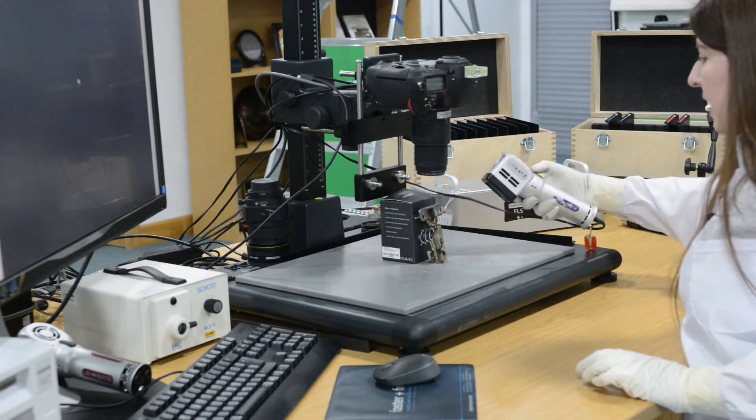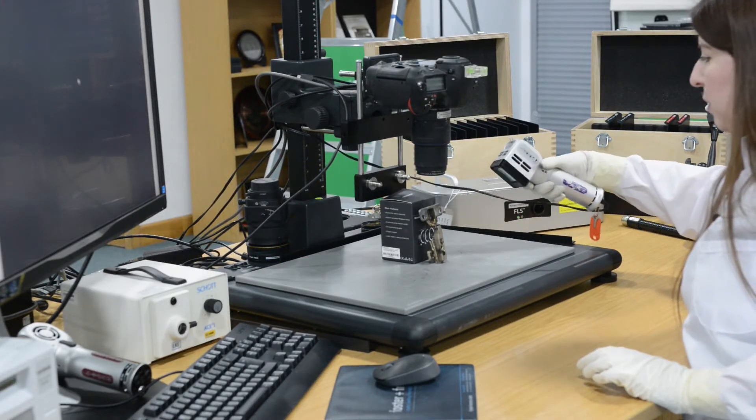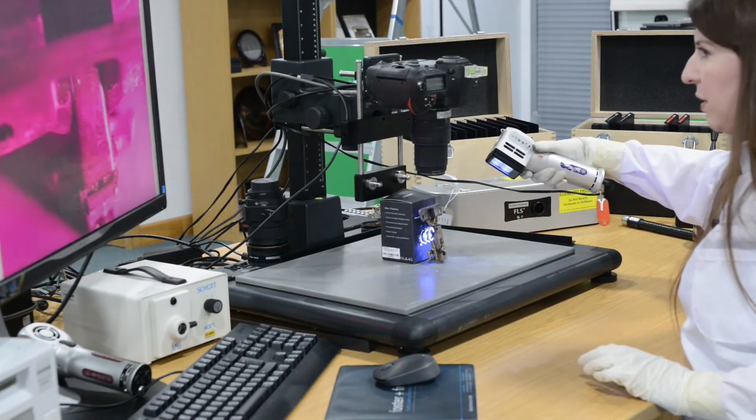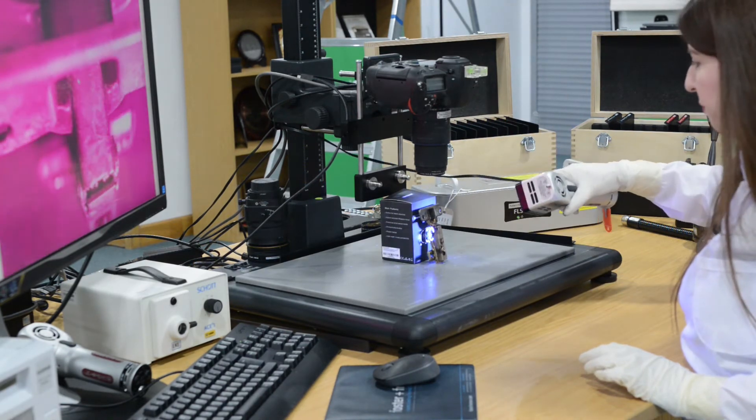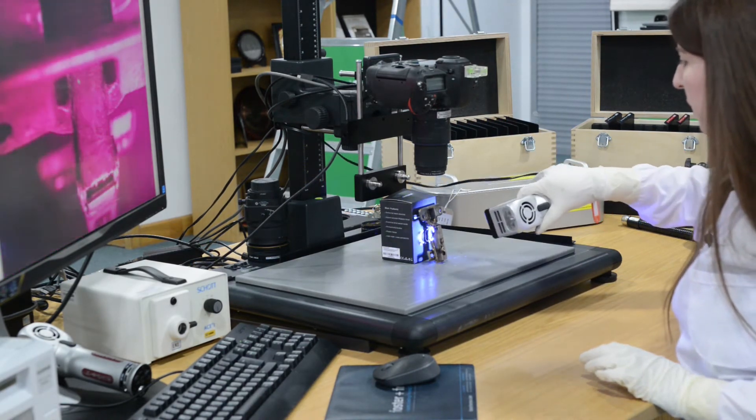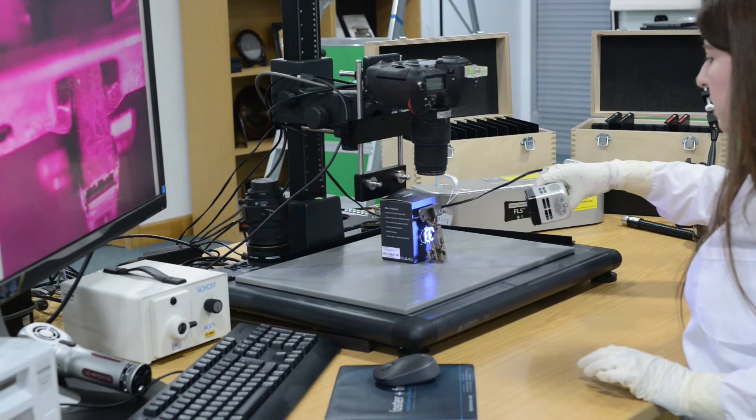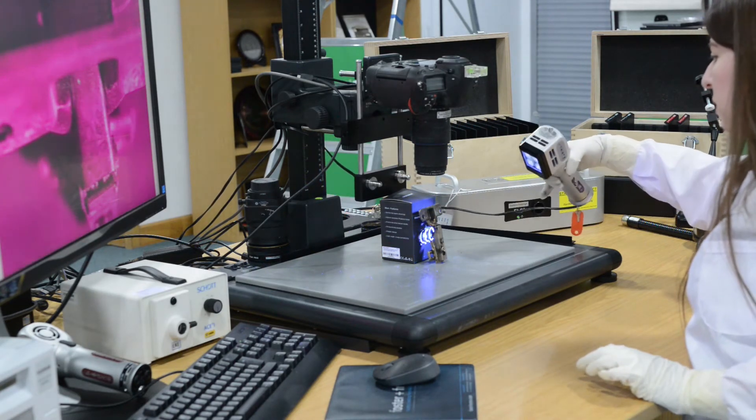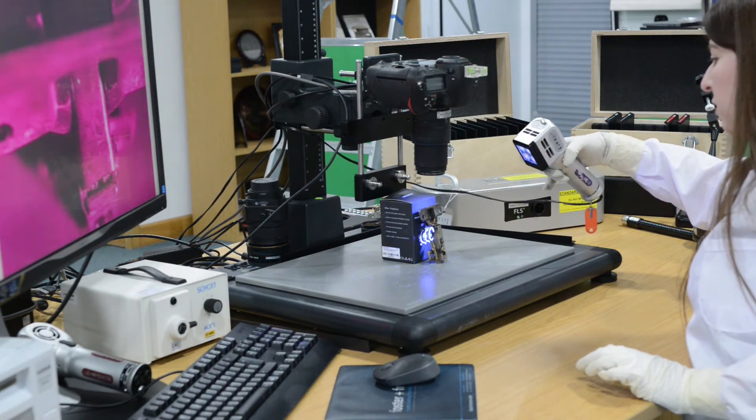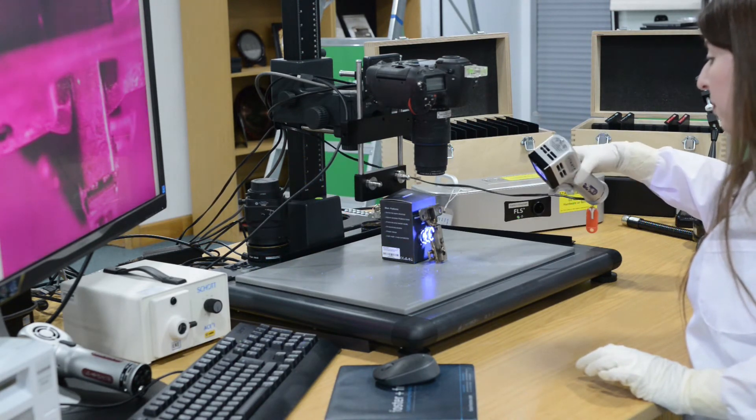For our second example we have another piece of metal that has been recovered from the arson scene and it's important to consider as well the different treatments that can be used for metals in particular.